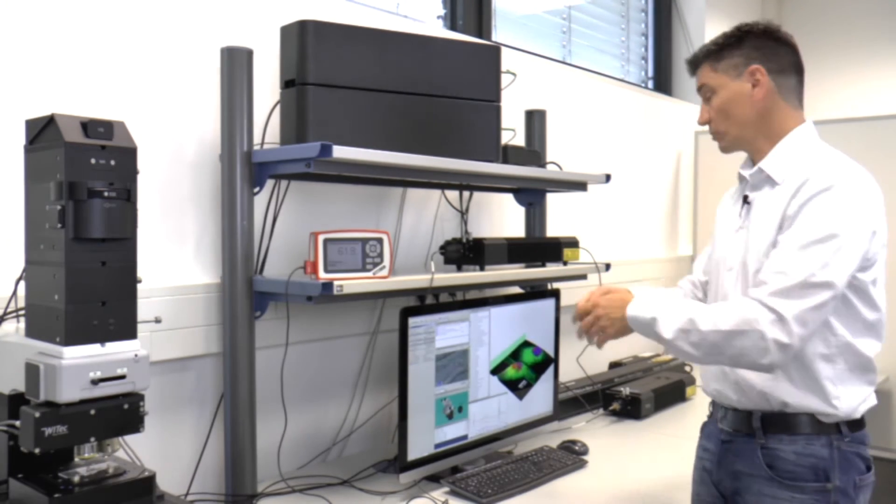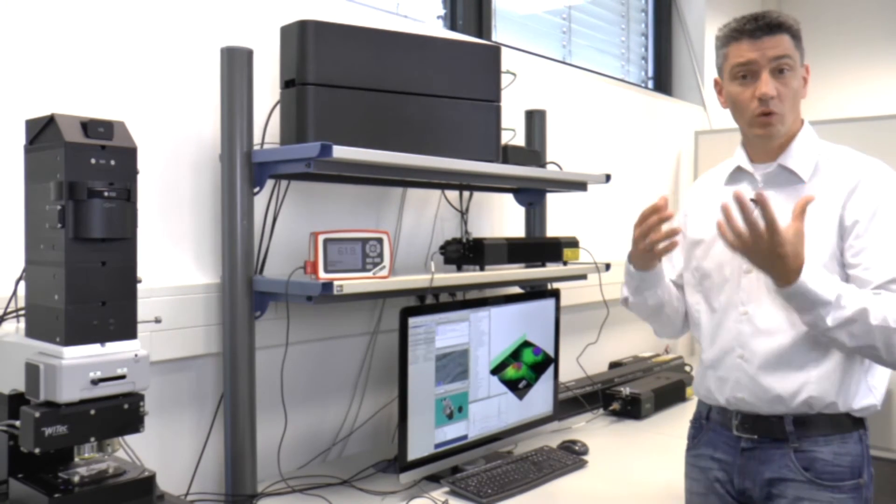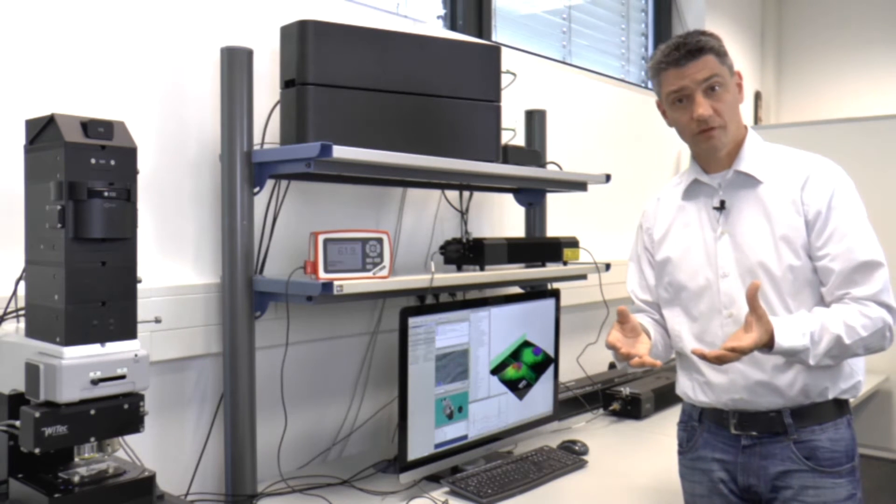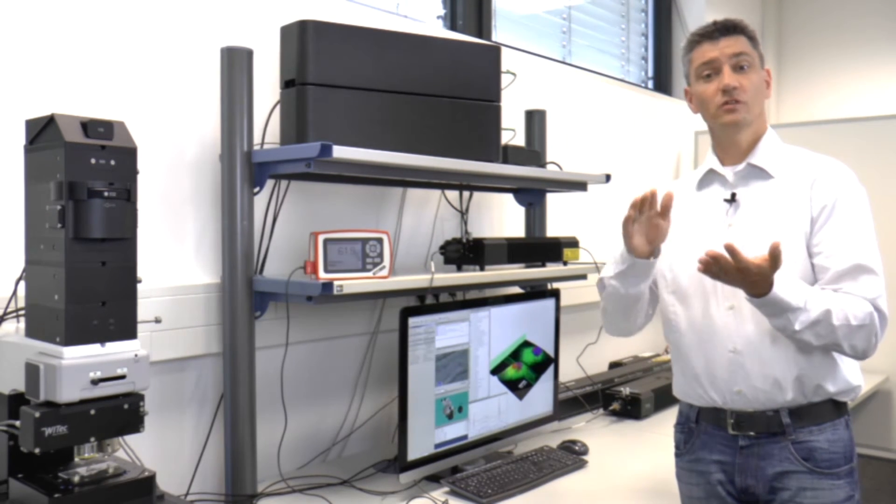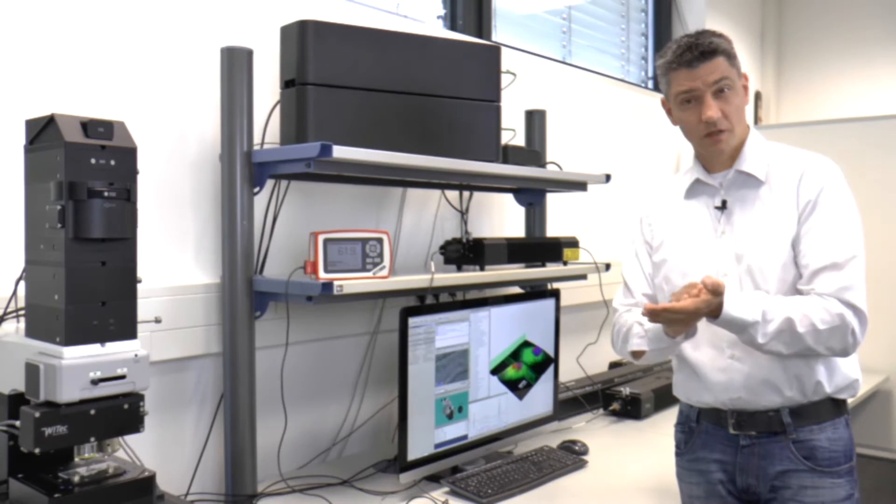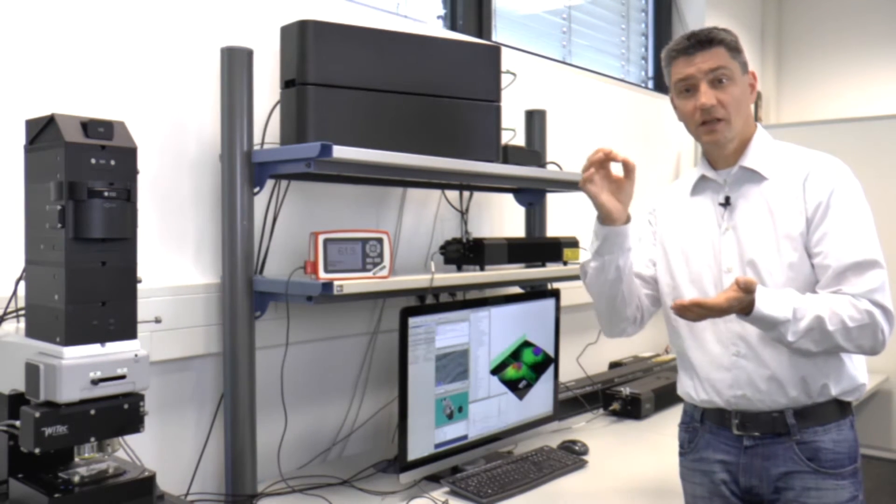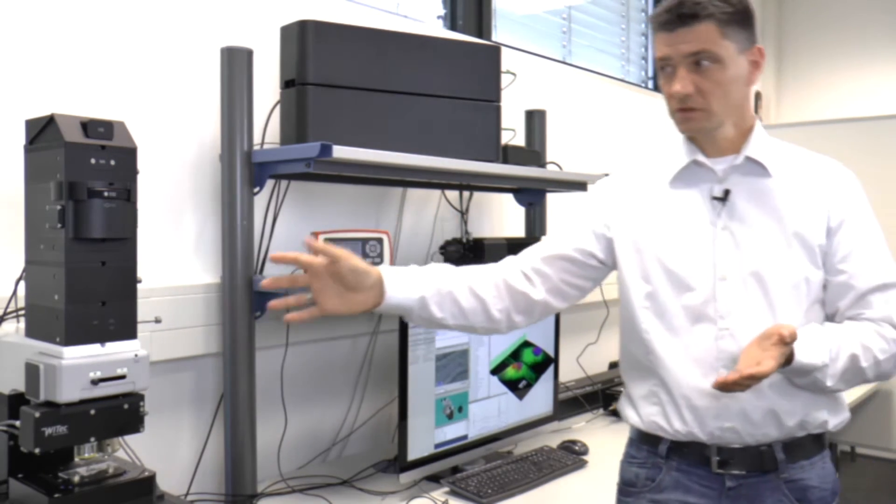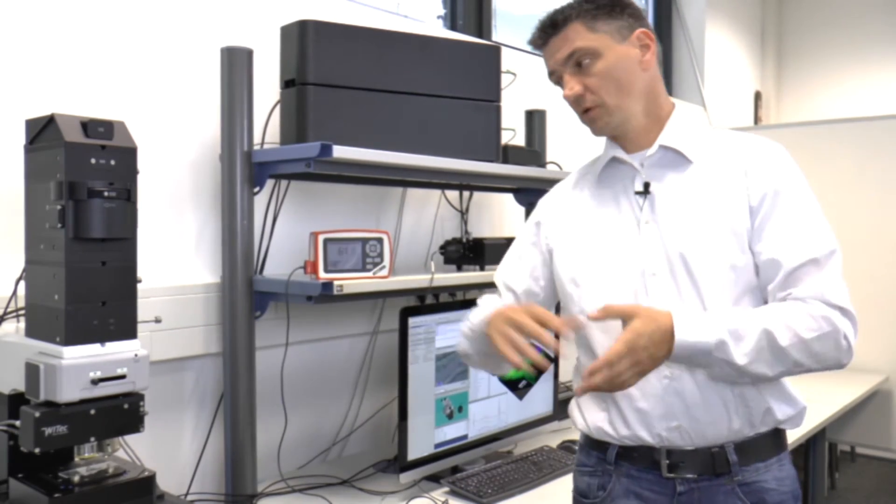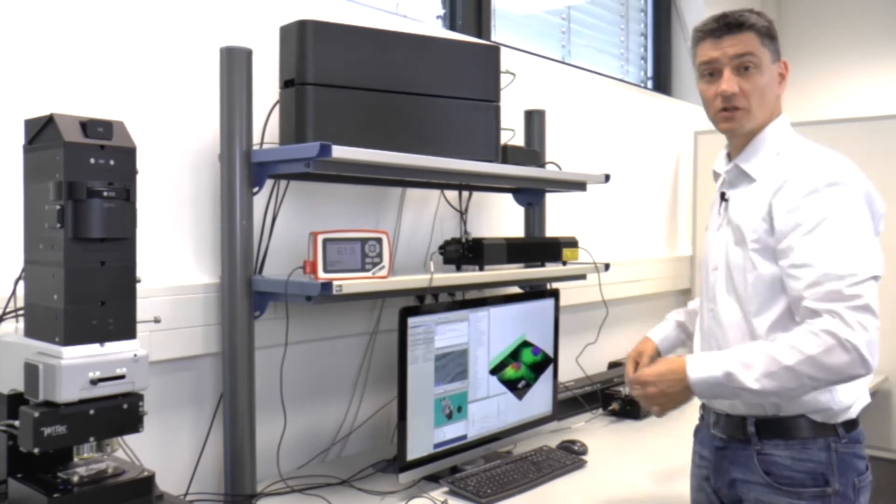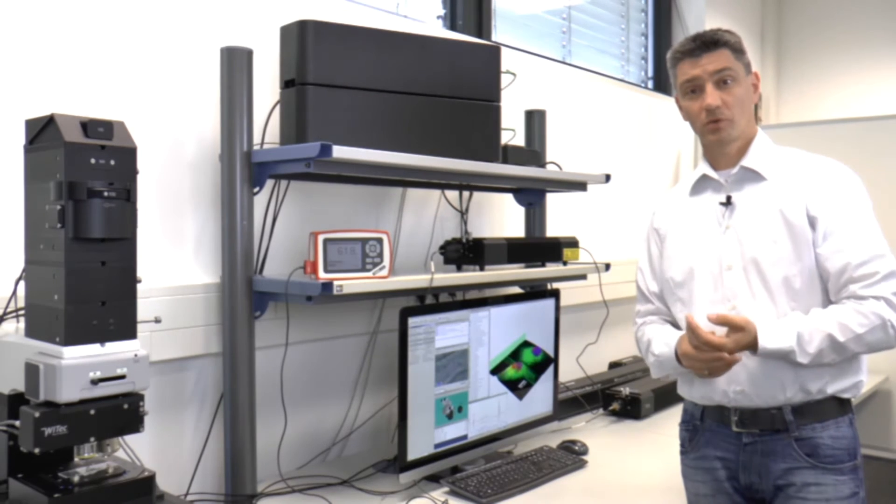The other advantage is that you can put it even further away because if you have an air cooled laser or fan cooled laser like an argon ion this produces a lot of vibration and a lot of heat and this heat can if it's very close to your system have an influence on your setup. With a spatial separation as you can achieve with the setup there's no problem with that at all.